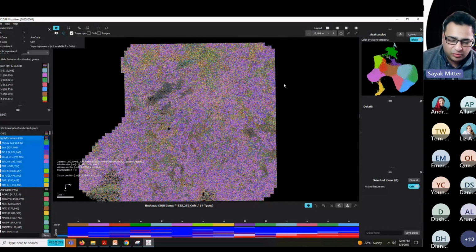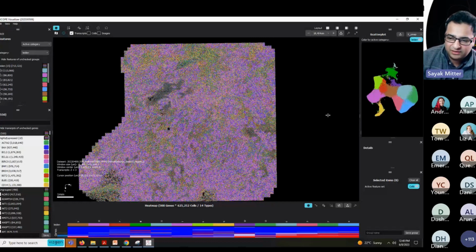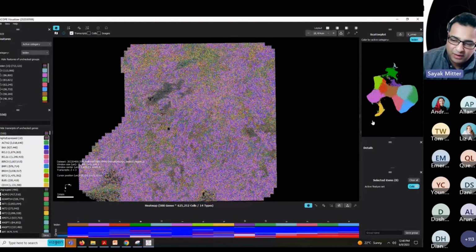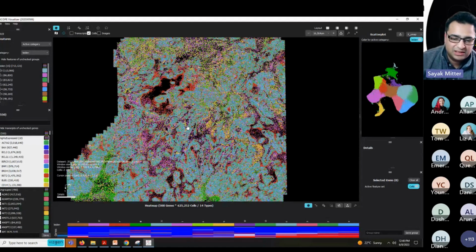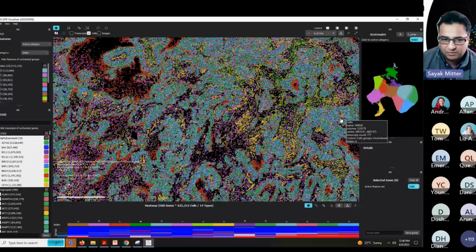And then once you import it back, you are able to visualize the single cell scatter, the cluster plot. The cluster plot has to be in a UMAP or t-SNE format. So here we have a UMAP. Now that cluster can be overlaid onto the cells here on top of the tissue. So now you can see the spatial distribution of the different cells in that scatter plot.